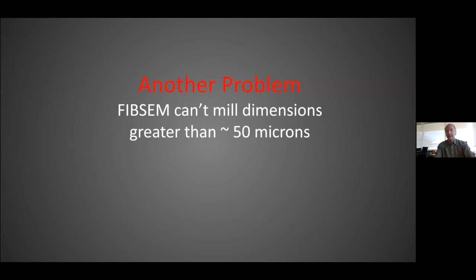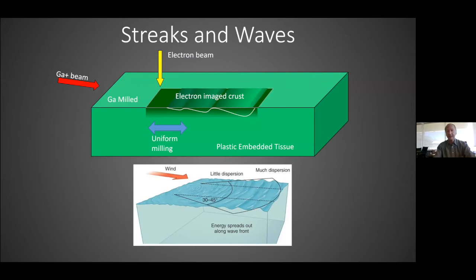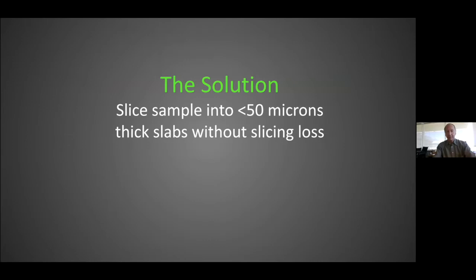But then we ran into another problem. This machine can't mill depths greater than about 50 microns. The ion beam essentially gets a little bit unstable. If you come in with an ion beam, you image it, you make sort of a burnt crust. The cutting gets a little bit unstable as this burnt crust interacts with the milling beam. I like to use the analogy, it's very much like wind coming on a pond. It looks good on the upstream side. But as you get downstream, there are waves and instability and cutting non-uniformities, which get more and more aggressive. So we had a problem again, and thinking hard, if 50 microns is too much, let's keep the samples less than 50 microns.